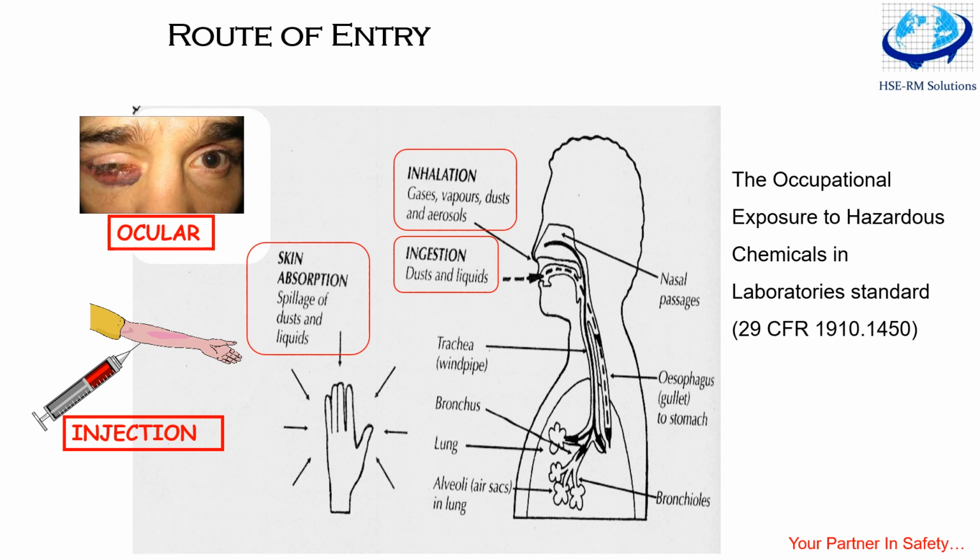So the very first way a chemical can enter your body is direct contact with skin, eye, mucosal membrane, or exposure to the agent. You must know that whatever is the open part of our face, chemicals can enter through our eyes and ears, so that is all mucosal membrane. The second way is parenteral inoculation. That is use of a syringe, or any sharp object that punctures your skin, or being bitten by some infectious animal or infectious agent.